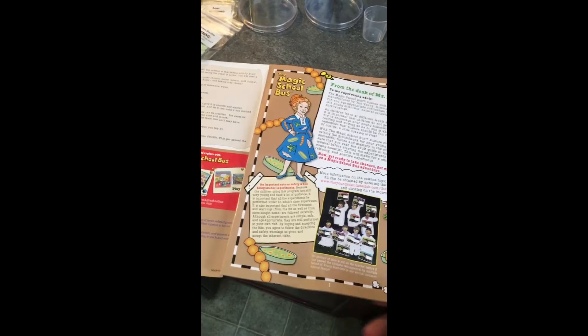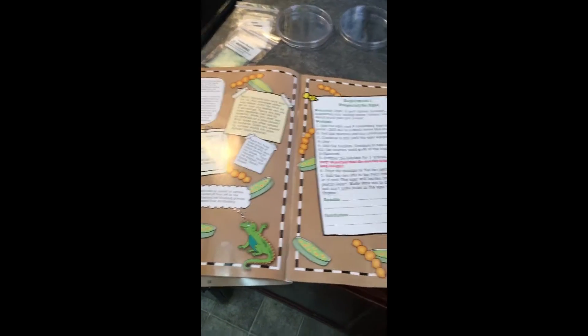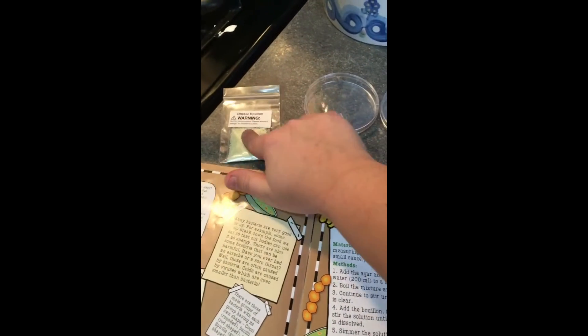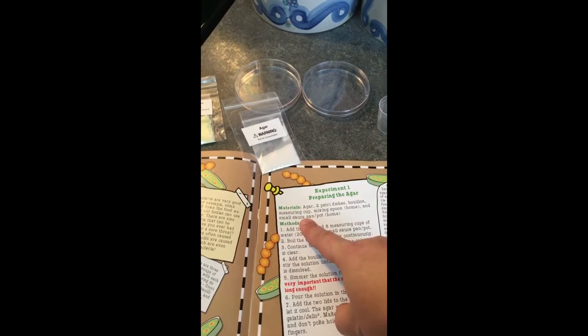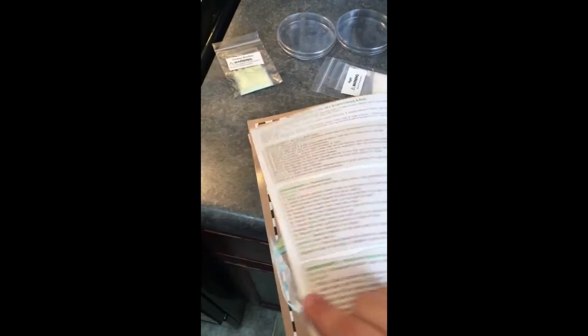Hey, welcome back! This morning in our science class we are starting the Magic School Bus Young Explorers Club science kit about bacteria and fungus. Today we are doing experiment one: preparing the agar. We have the agar mix, chicken bouillon, two petri dishes, a measuring cup, a mixing spoon, and a small saucepan. I'm going to flip to the back where there are more detailed instructions for the supervising adult.